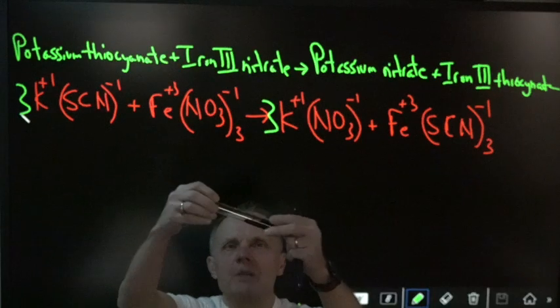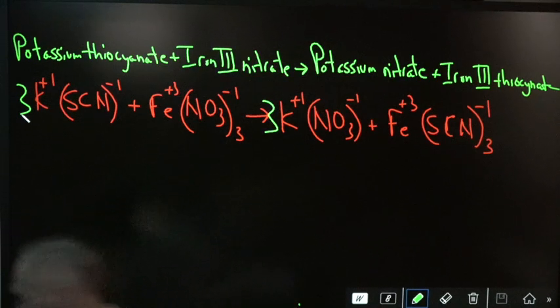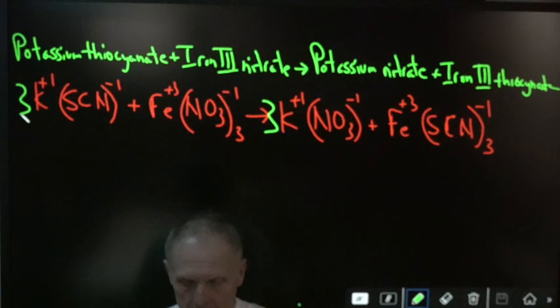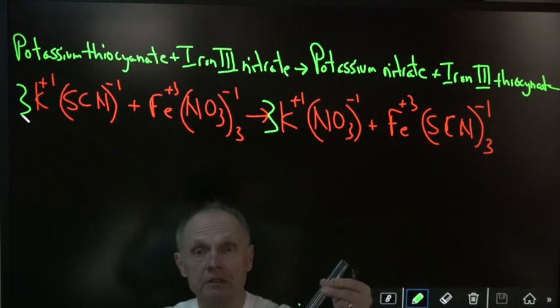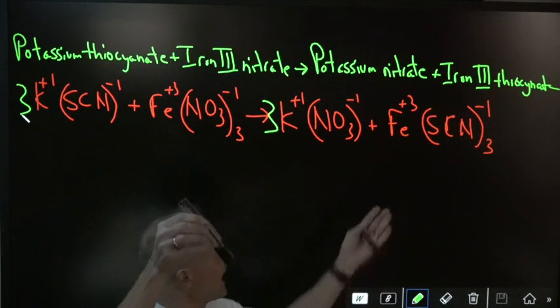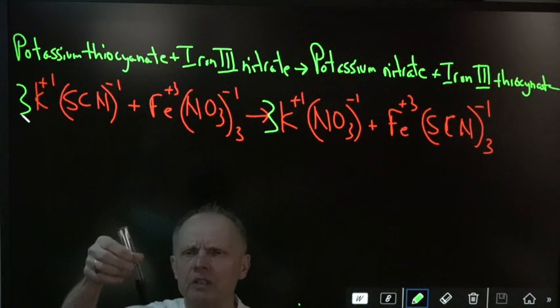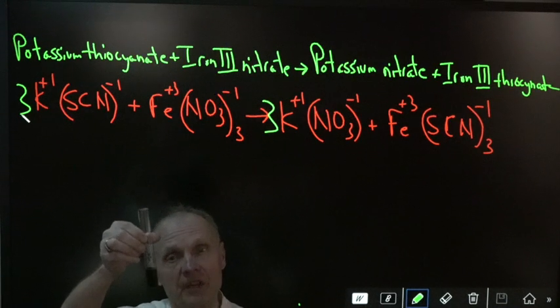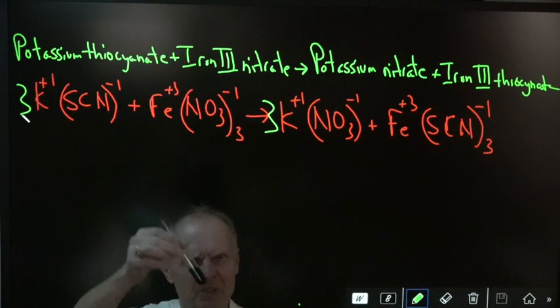So something really happened, all right? And now, I call this the Dracula lab because this stuff looks just like blood, all right? But the problem is something happened, the color changed. So if the color changed, that must mean there's a chemical reaction, but nothing is falling out. This is a very weird thing going on here. Nothing is falling out. So there's actually no precipitate, all right?